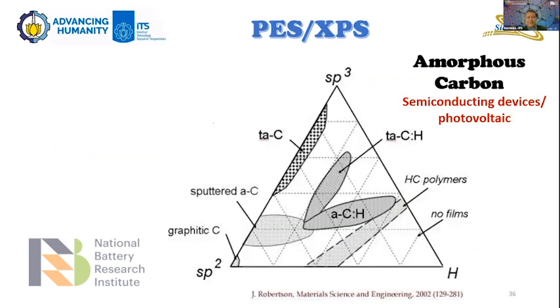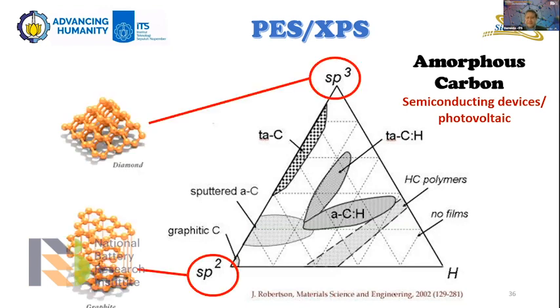Okay, now move to amorphous carbon. I think from the previous presentation, somebody asked about the carbon. We cannot use the XES for carbon because at the SLRI facilities the lowest energy is around 1 kilo electron volt, and carbon is below 1 kilo electron volt. So we use the PES, photoemission spectroscopy. But for this purpose, we prepared our samples not as powder but as film. We deposited some dissolved powder with a special solvent on glass or other substrates. Okay, the amorphous carbon like this.